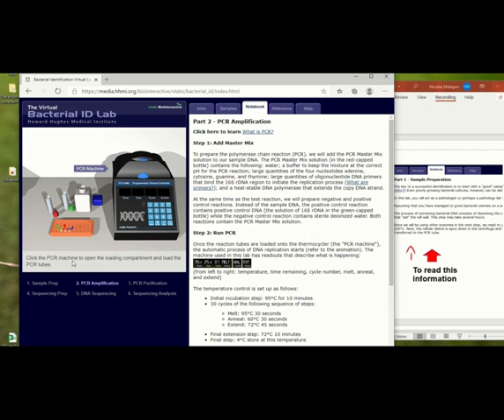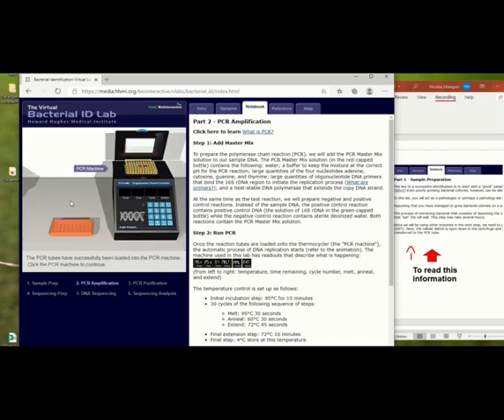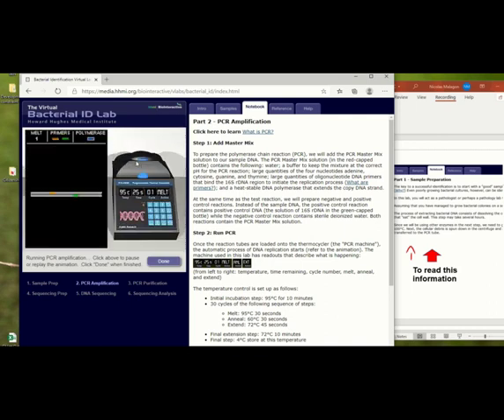Then it said click the PCR machine to open the loading. So now you're going to move this here. So you take all the samples and you put it into this machine that is called a thermocycler. And in the thermocycler, what you have is the change in the temperature. And during this step, they run the PCR, and now we have to click to close the machine. And CMU has a thermocycler, and here they explain what the thermocycler is doing.